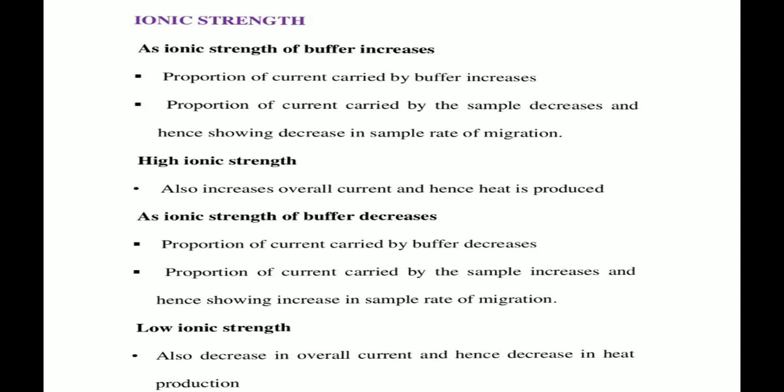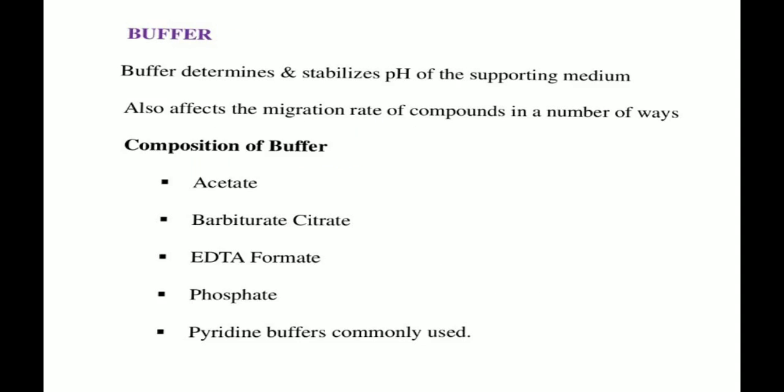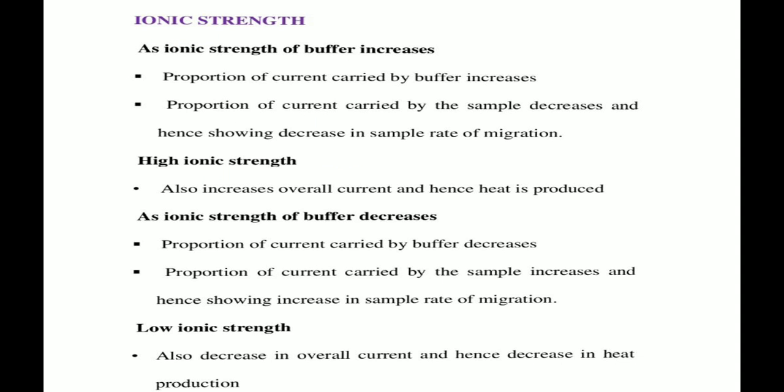In concentration, the proportion of current which is carried by the buffer increases and that carried by the sample decreases as the ionic strength of the buffer increases.